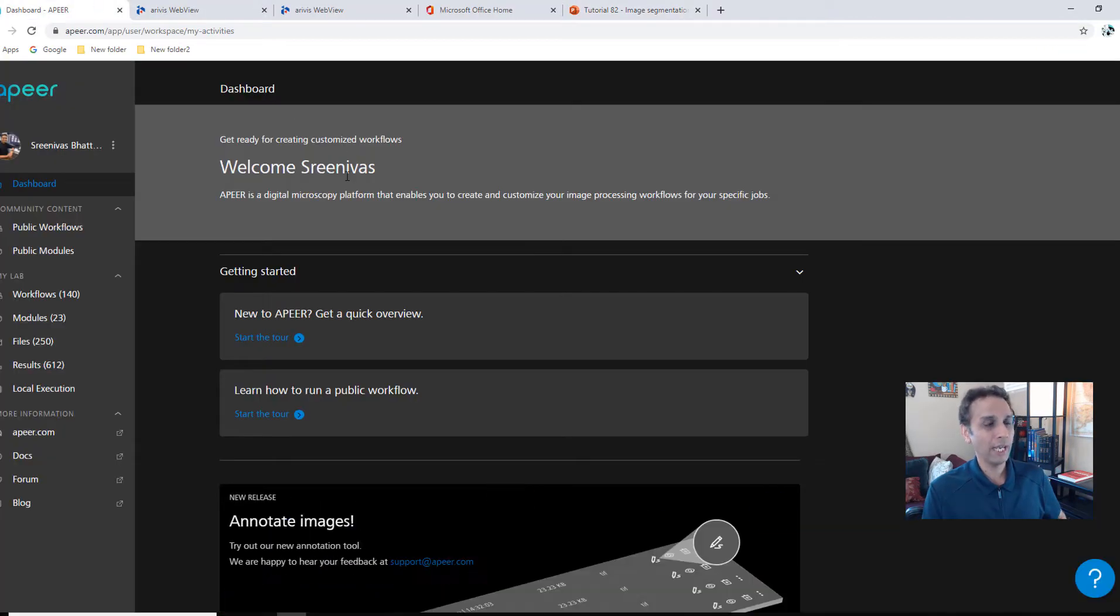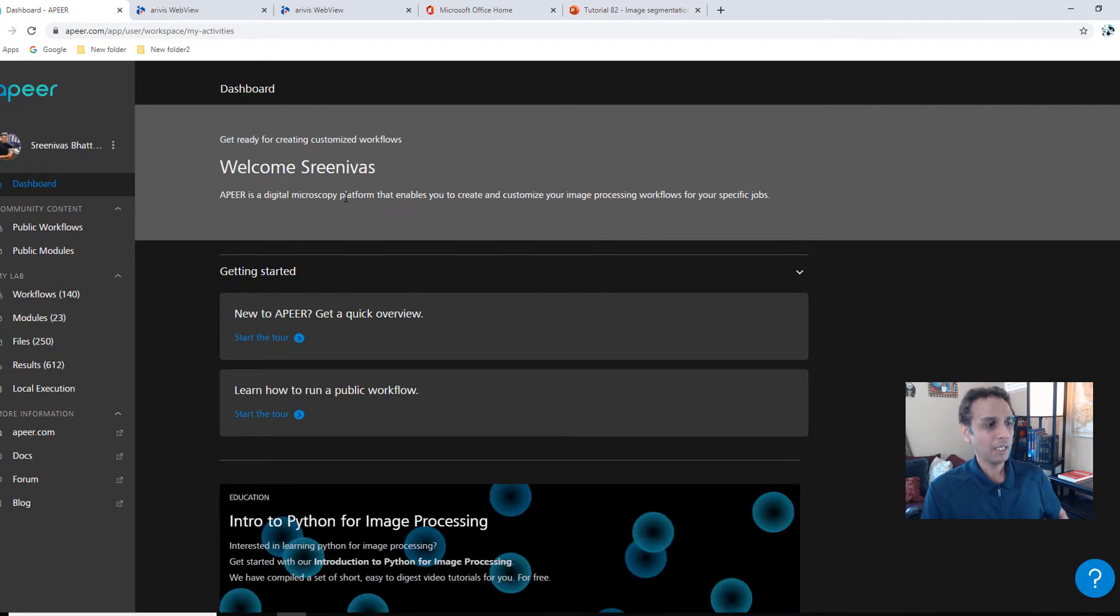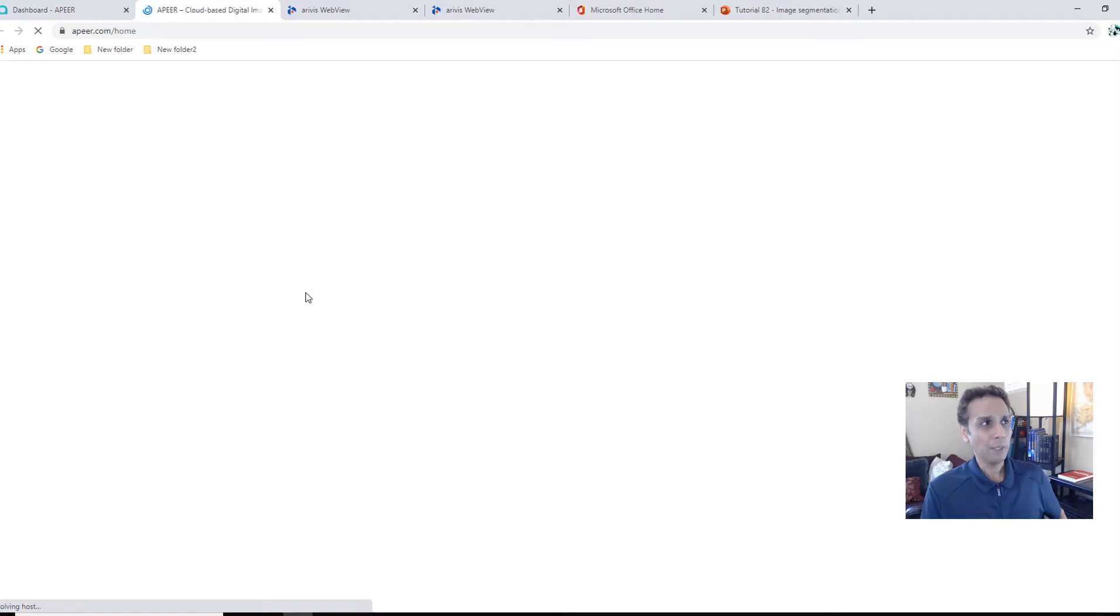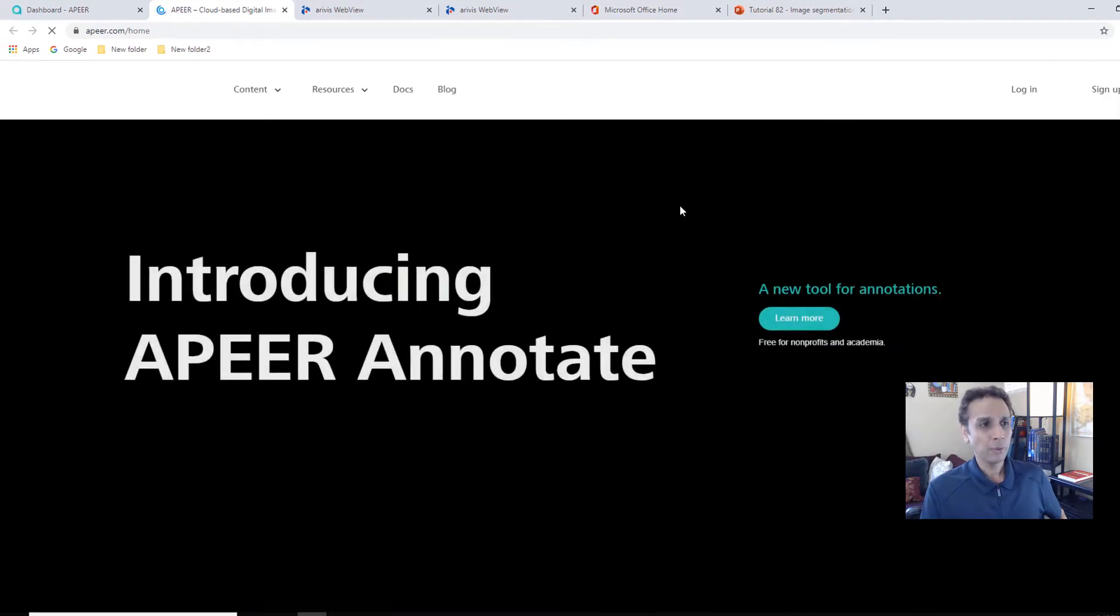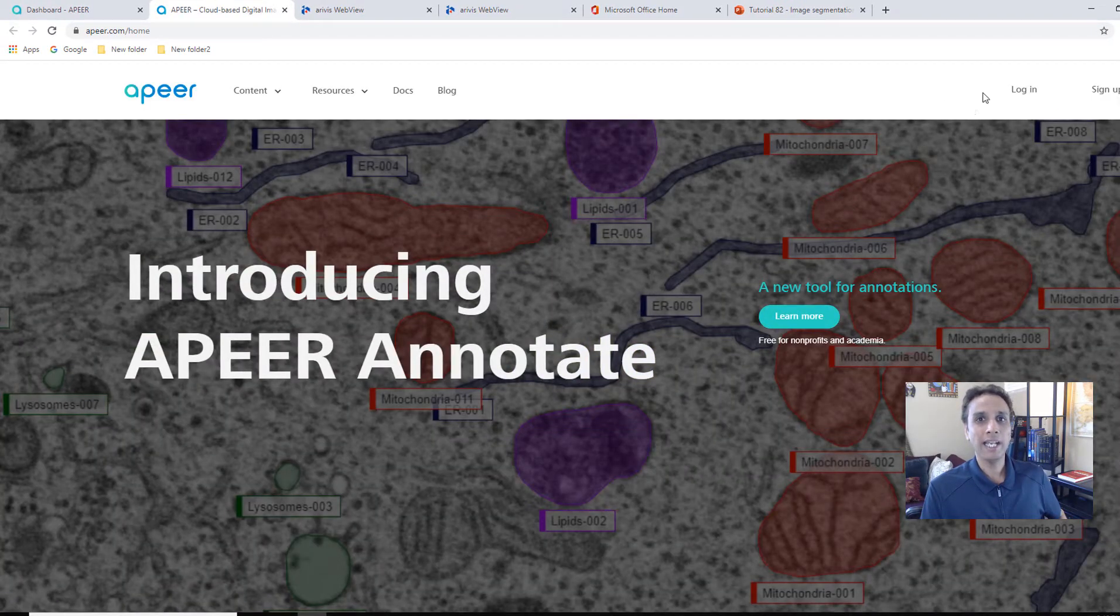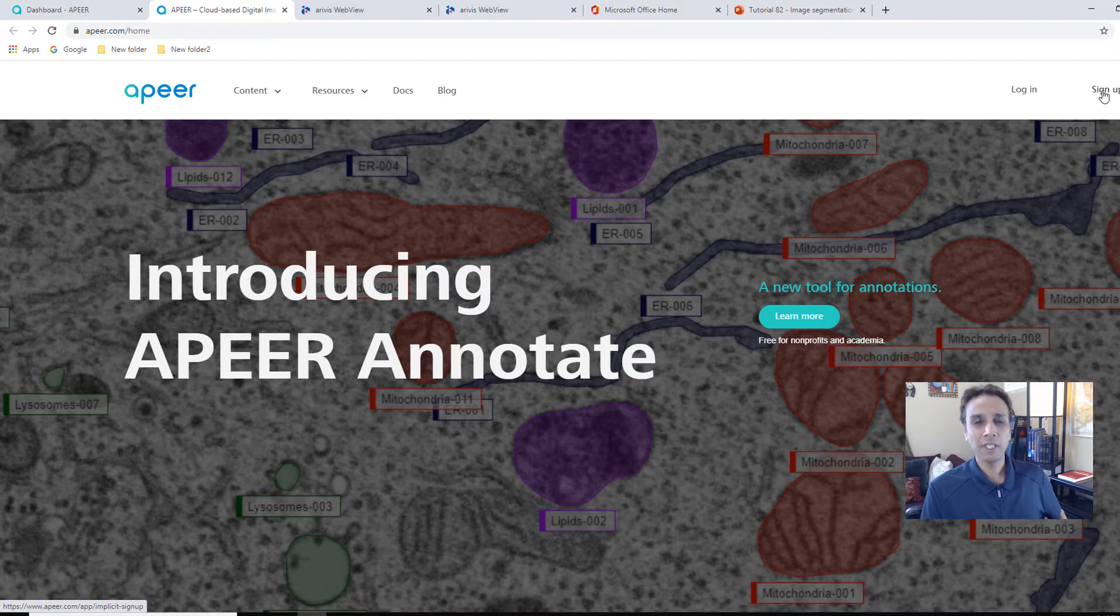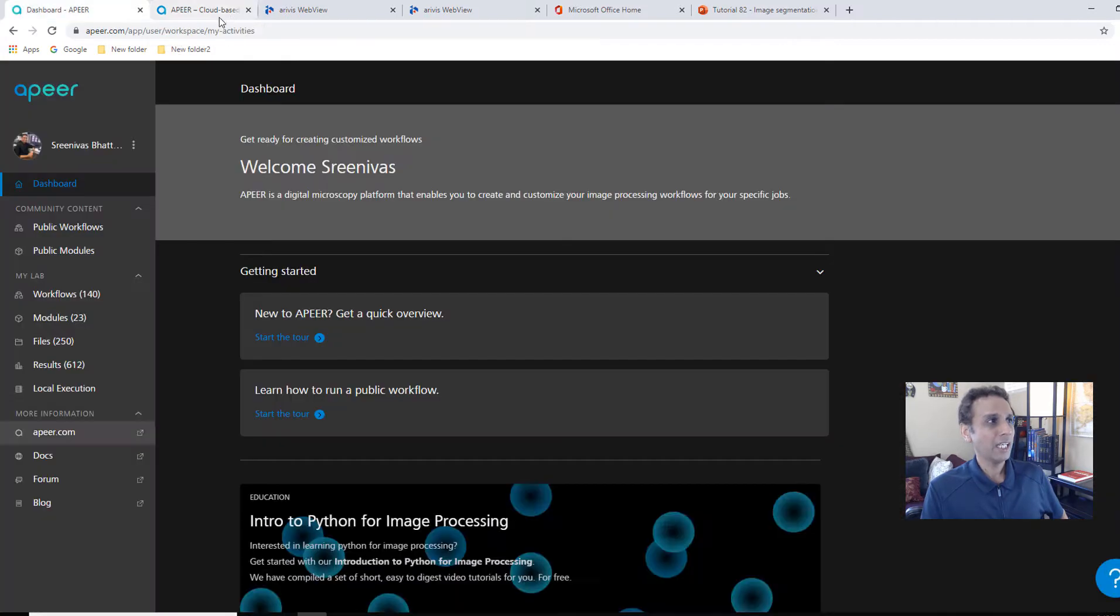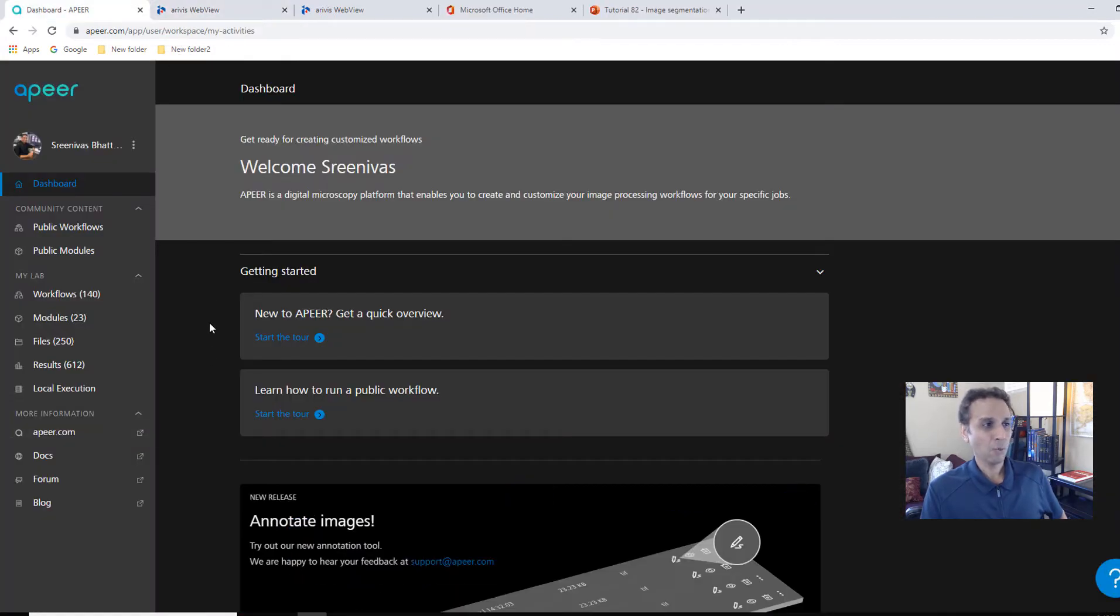First of all, go ahead and type www.apeer.com. If you have never signed up or never logged on to APEER, you would run into a page that looks like this. Go ahead and click on sign up. It should take a couple of minutes for you to sign up. Once you log in, it should look somewhat like this.